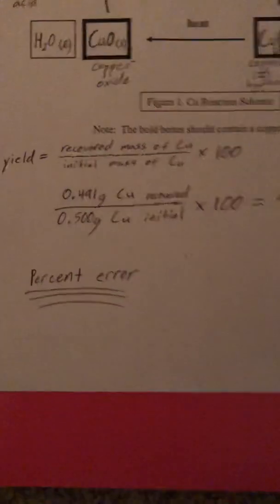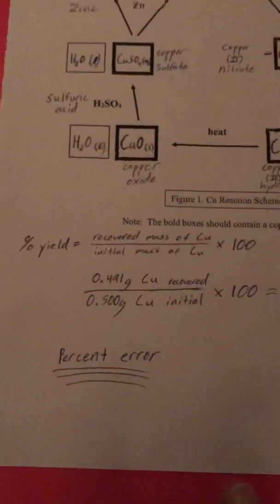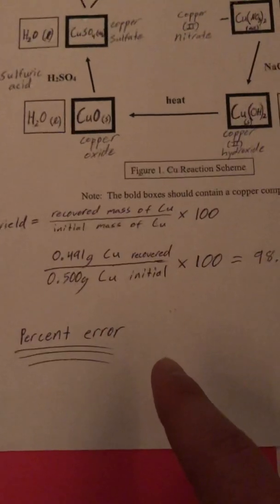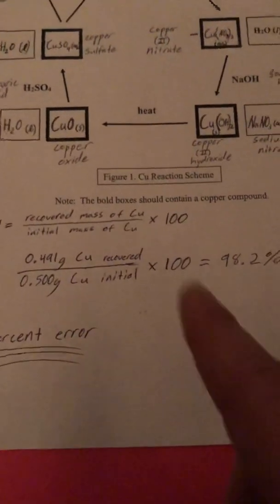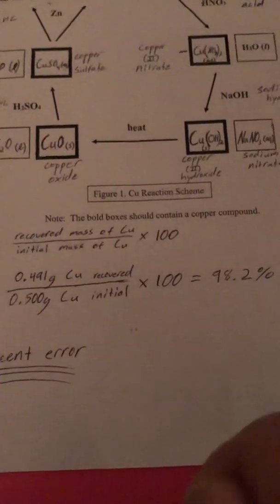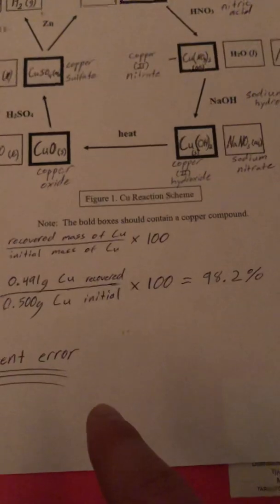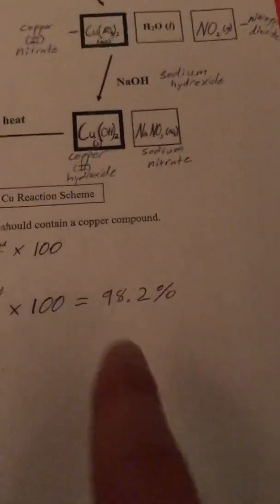In this experiment, a series of percent errors can occur, just like in every other experiment. One example of falling below 100% would be a series of decantation errors. It is very hard to pour out the solution without losing some precipitate. And if you lose precipitate, it actually takes away from your percent yield, which will then make you fall below 100%, which could be a big reason why we fell below 100% in our experiment.